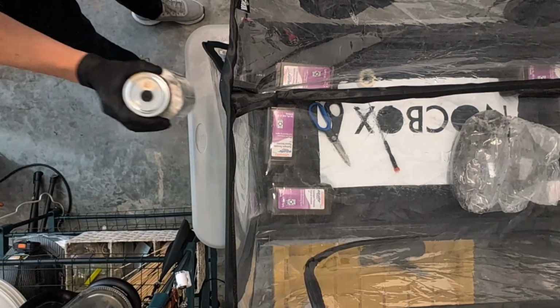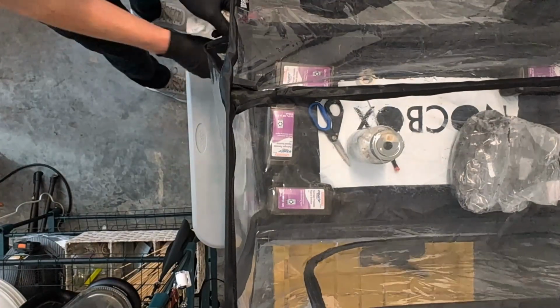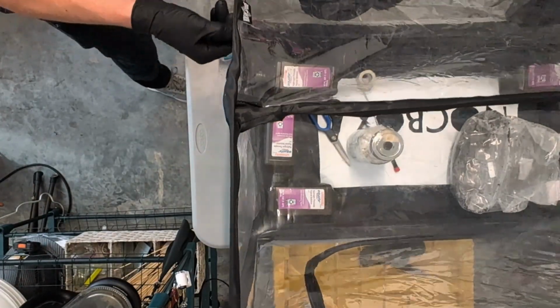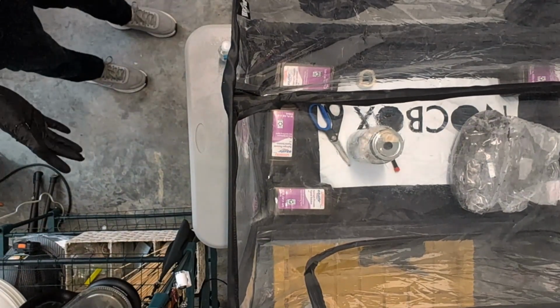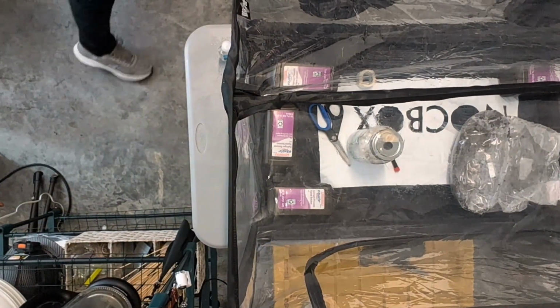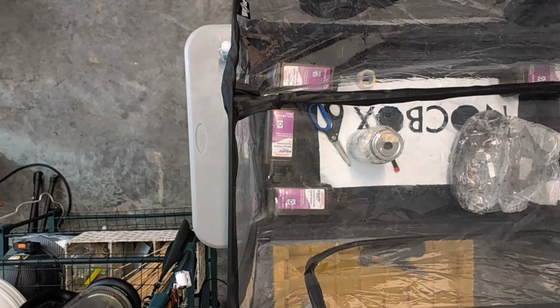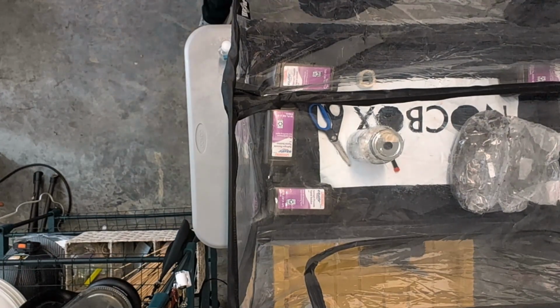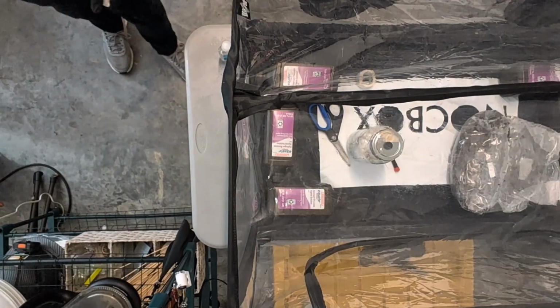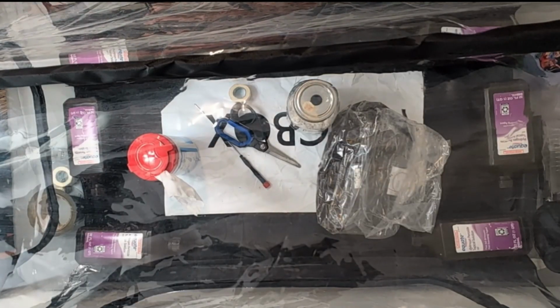Do you see, I set this on the table, immediately picked it back up and hit it again with the alcohol. Anytime you're sanitizing something and it touches another surface before putting it in the still air box, you need to clean it again. Now I have everything I'm going to need inside of the still air box.